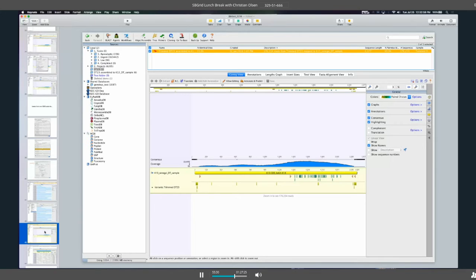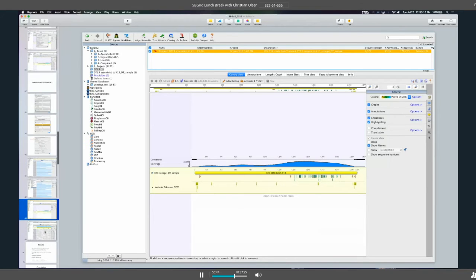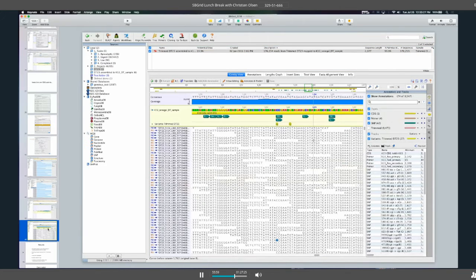Hopefully right off the bat, you can see that we've eliminated a lot of different steps, and each of those steps that we eliminated are opportunities for error to be introduced. We all get tired when we stare at our screens 10 hours a day, 7 days a week. It's best to automate as much as you can with sequence analysis. Here we did the trimming, the mapping, and the SNP calling, all in one fell swoop. If I zoom in, I can see the canonical SNPs that were annotated on my reference prior, and then I can see the SNPs that were called as part of the workflow.